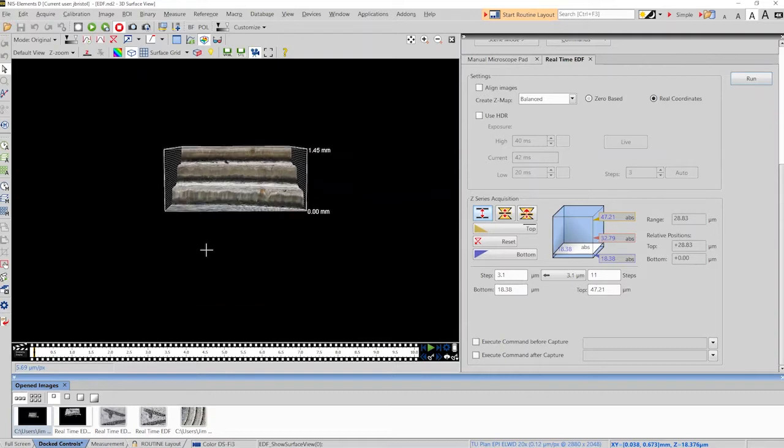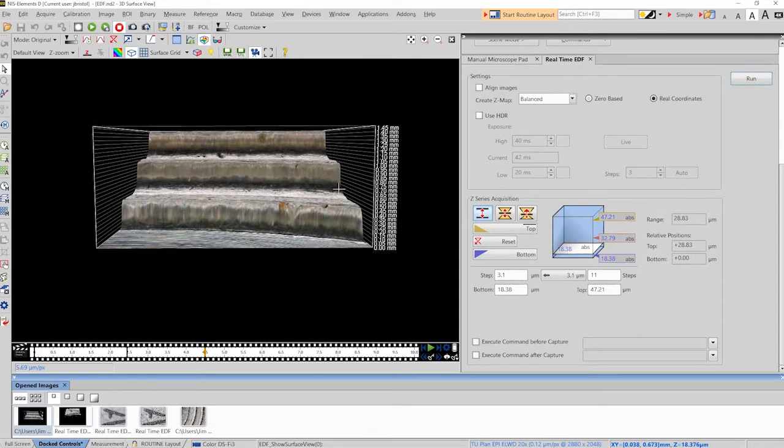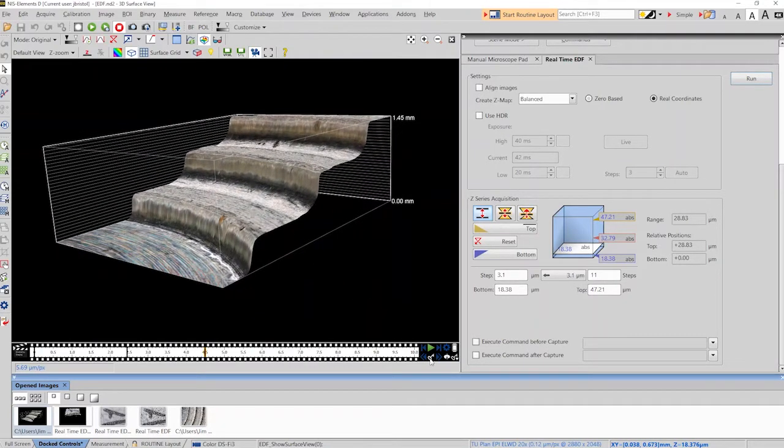I'm going to bring it forward a little bit, an update key, 2.5 seconds. Bring it forward a little bit more, update key. Let's do 4.5 seconds. Now I'm going to move it down, and I'm going to begin to rotate it. And I'll do an update key and make that 6.5 seconds.